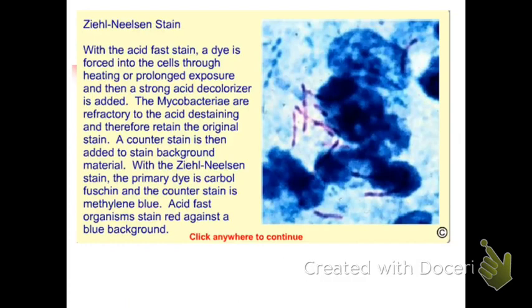Okay, so this is an appearance of the Ziehl-Neelsen method. So, where is the Mycobacterium here? There. Okay? So, these bacteria would be what? Non-acid-fast organisms as they take up the methylene blue counterstain. So, Mycobacterium tuberculosis will take up the red acid-fast bacilli.